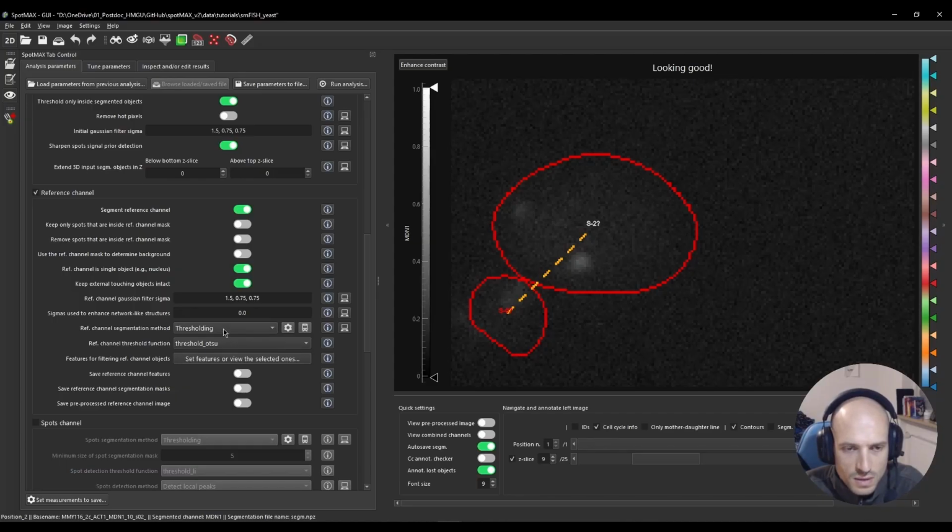And in a second, we can look at all of them. But Bioimage.io model is this really cool community effort of AI models that you can use. You simply go on the website, Bioimage.io, scroll through the images and see which one might look like your data. If you're lucky, someone already made an AI model to segment your structures. You can take down the URL, the DOI, the zip, and place it here.